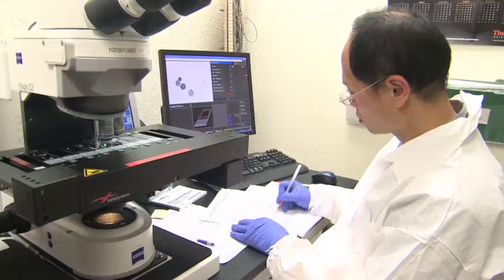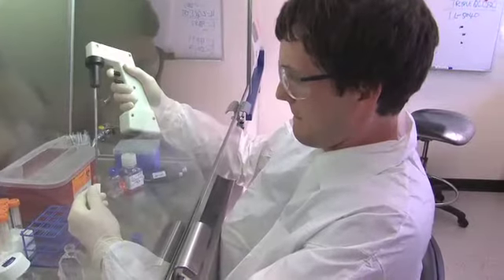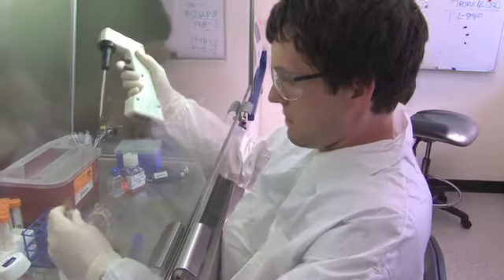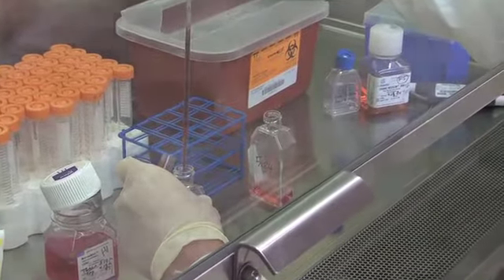We use flow cytometry to define the composition of the specimen. We can identify each and every cell as it goes through the flow cytometer. We can identify whether it is of one lineage or another, and whether it's normal or abnormal. We can do this for blood or bone marrow or tissue, and we can then characterize those cells, enumerate them, and so we know what is within that specimen. We then do subsequent tests to identify the prognosis or maybe even monitor treatment of that patient, but it requires our understanding of this composition of the specimen in order to interpret those results.